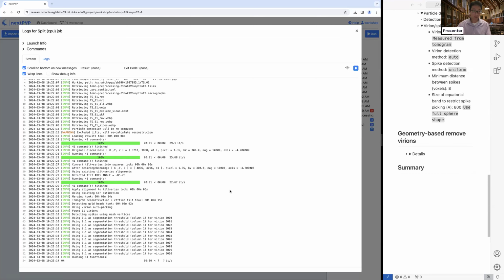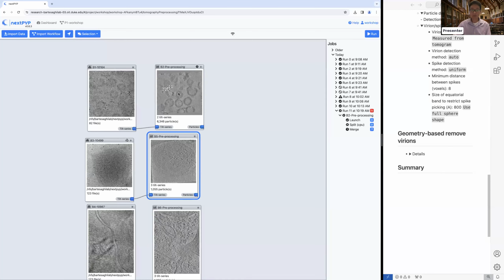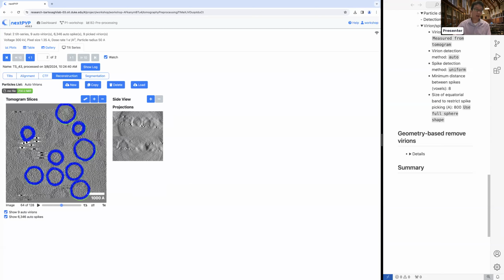All right. Yeah, I think this is working. See, there's a warning. It doesn't matter. A warning just gives you awareness that something happened. It doesn't mean that bad things happen. Just ignore it. All right, something is showing up. We can get it open. Right, that looks good.